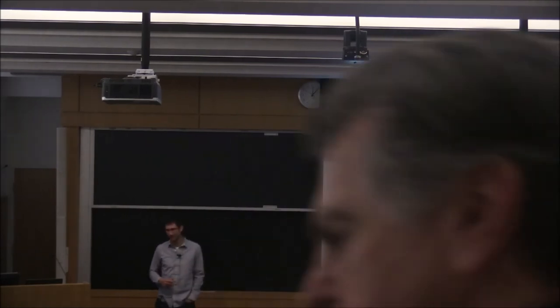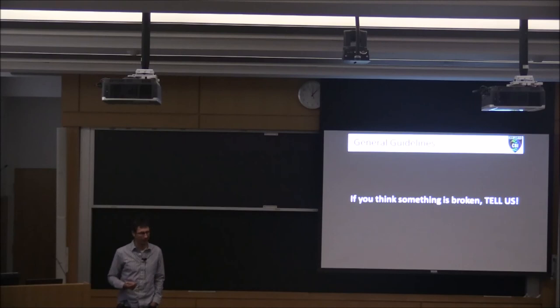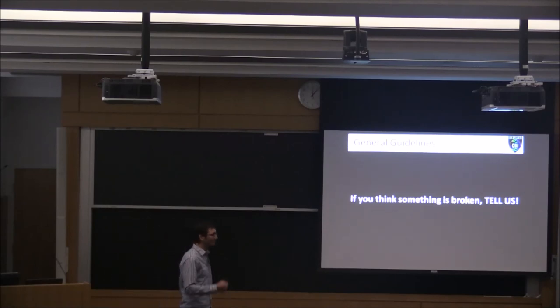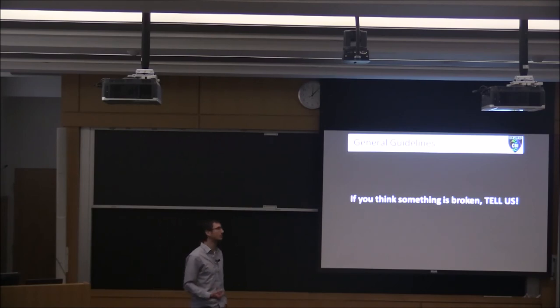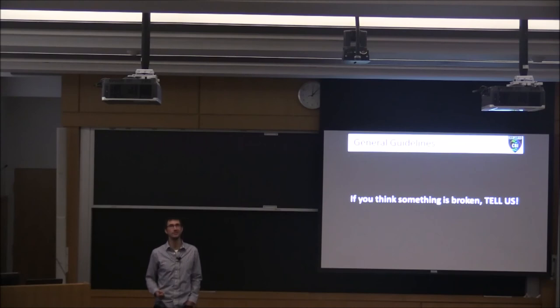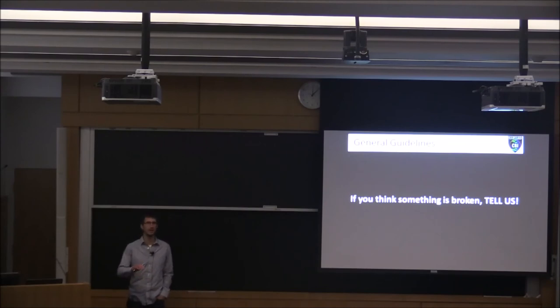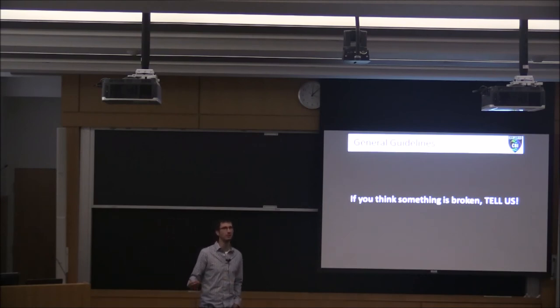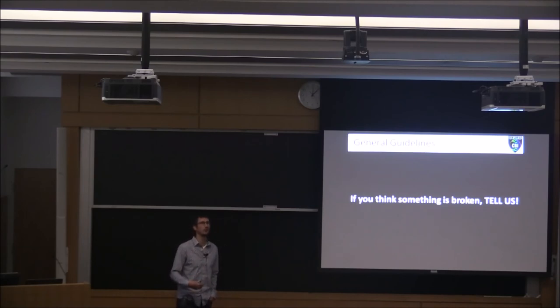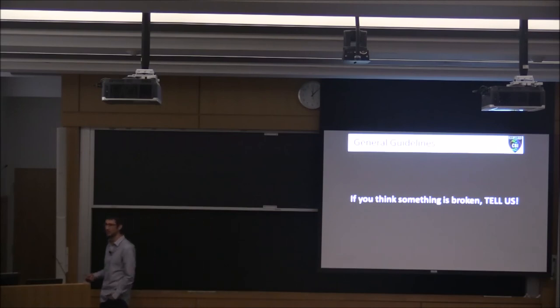You will see a variation of this slide at least three times through this presentation. If you don't take anything away from today, take this: if you think something's broken or not working right, just come and tell us. If you think there's something on an objective, come and find one of us and let us know. If we're not around, send us an email — we'll look at it right away. The worst situation is when something is kind of broken but not really broken, and we go through two weeks of people getting crappy images before we notice it.